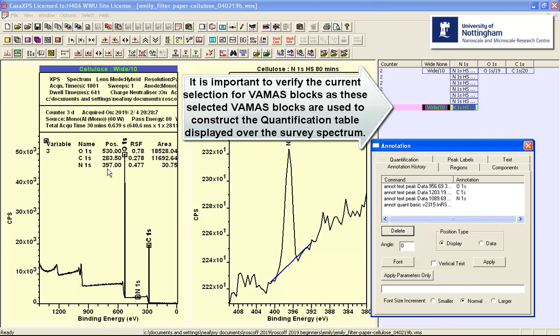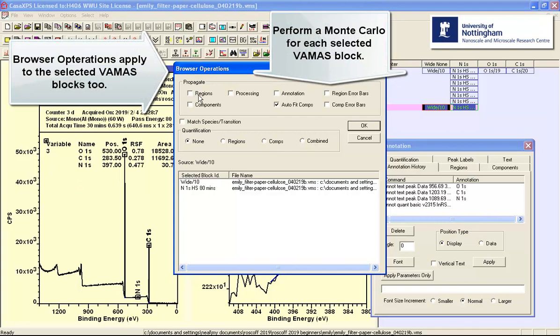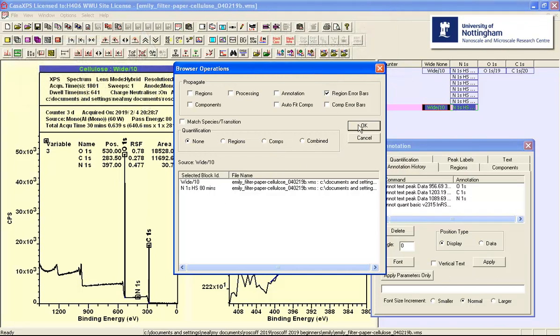And I still have these two selected. So I'm now going to do the Monte Carlo calculation that's based on both of these data. And I can do this using a right click and then select the error bars calculated for regions. There's no auto-fitting involved, so I'll take that off. And it's indicating that these are the two VAMAS blocks that are selected here that will be used for the calculation.